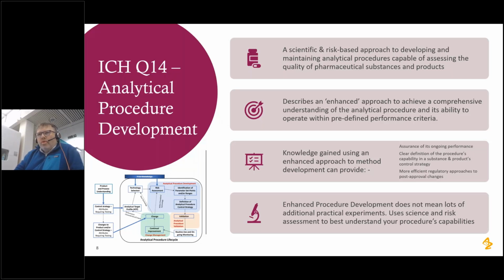And what's happened recently within the regulatory environment is that the ICH group have released a new guideline or a new procedure named Q14, and this is analytical procedure development. This starts to talk about how you might be able to give yourself as an organization more benefit by understanding your methods in more detail. This idea that your analytical procedure or method that you're developing is there for the lifetime of a product. It's not just there for a moment in time.